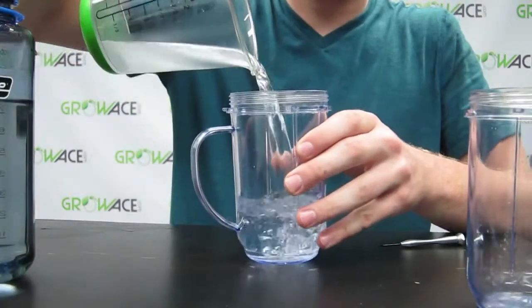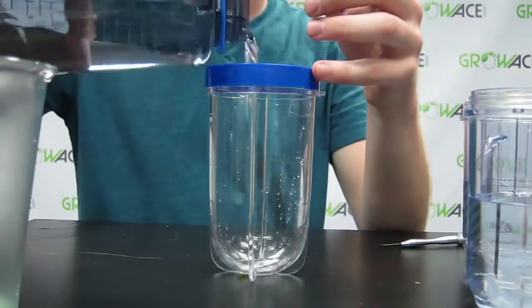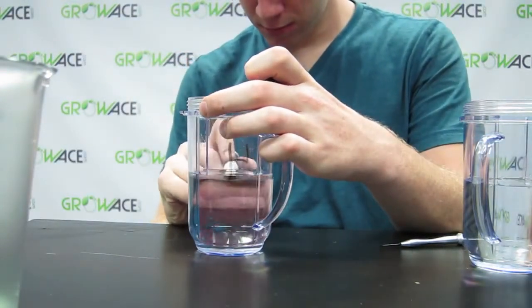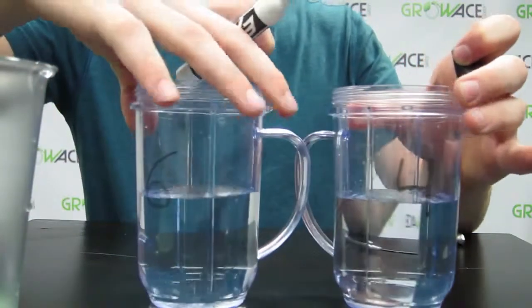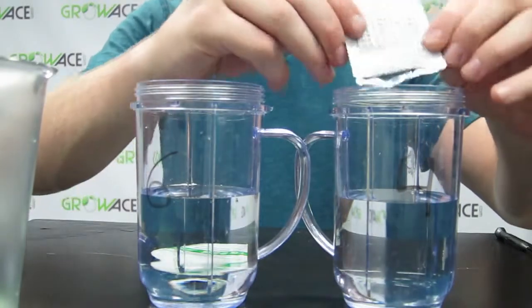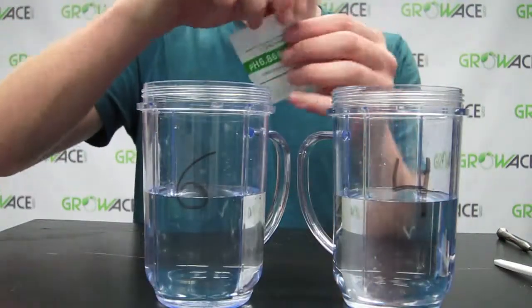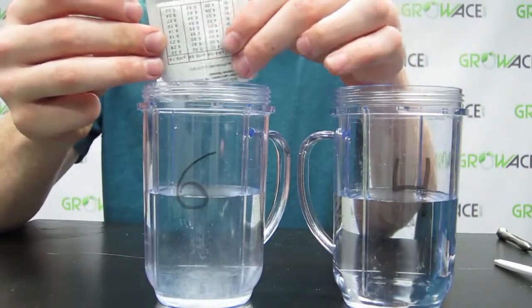Get your three cups. Fill two of them with 250 milliliters of water, and the other one half to three-fourths full of water. Mark the 250 milliliter cups with a four and a six. Grab the number four cup and add the pH 4.0 buffer powder, and gently stir until it dissolves. Grab the number six cup and add the 6.86 pH buffer powder and gently stir until it dissolves.